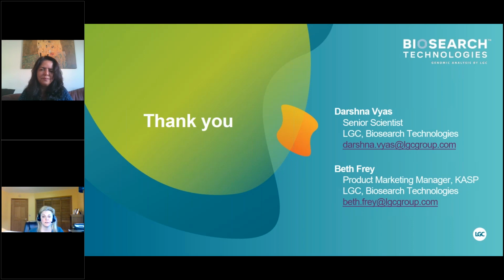Similar question to one we had above, but do you have any genotyping panel for cotton? Not on our website, but I do know of papers where they are talking about KASP markers for cotton. So please get in contact and I will try and pull them out for you.